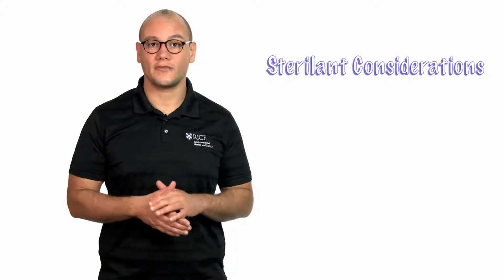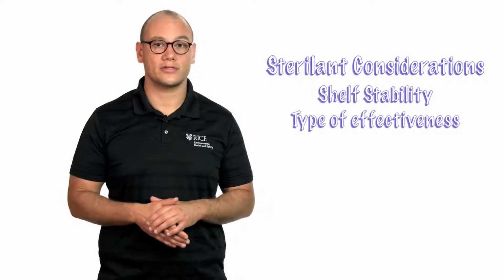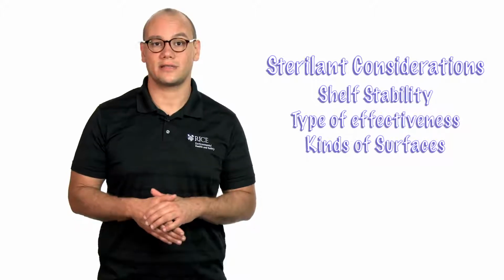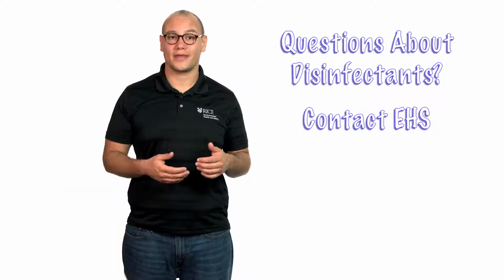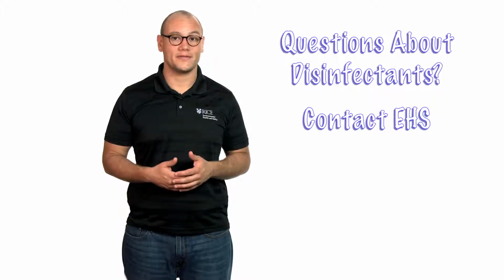If bleach and alcohol aren't appropriate for the work taking place in your laboratory, there are a number of commercially available options that could be right for you. Please make sure to consider the shelf stability that you're looking for, the type of effectiveness, or what kind of organisms you're trying to destroy, and the kinds of surfaces that will come in contact with the sterilants and disinfectants. If you have some questions or need some help picking the right kind of disinfectant or sterilant for your lab, feel free to contact Environmental Health and Safety.